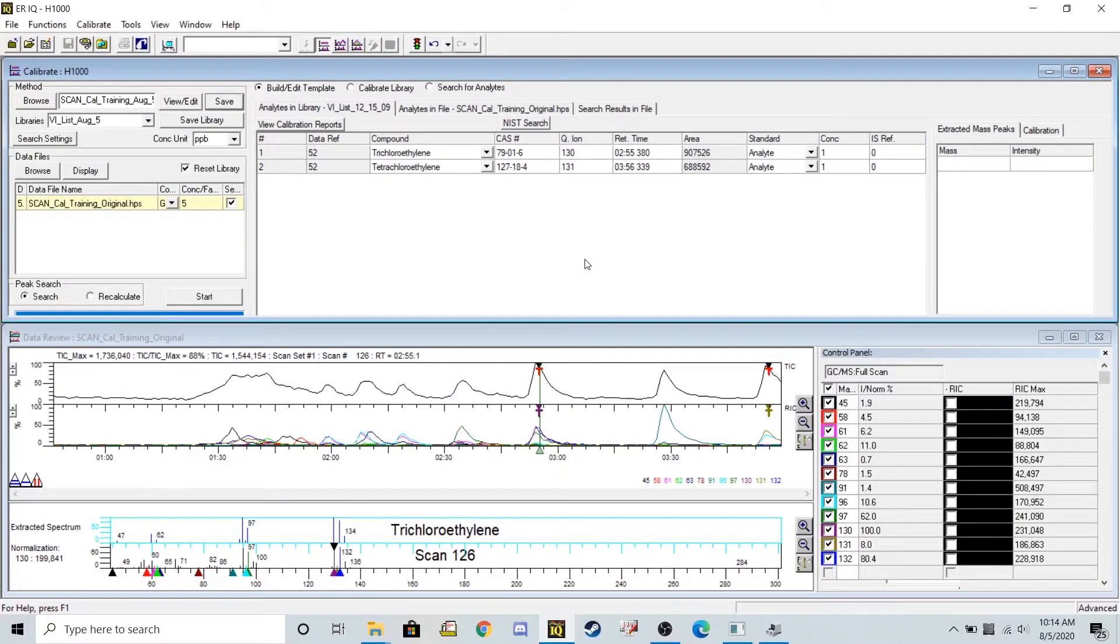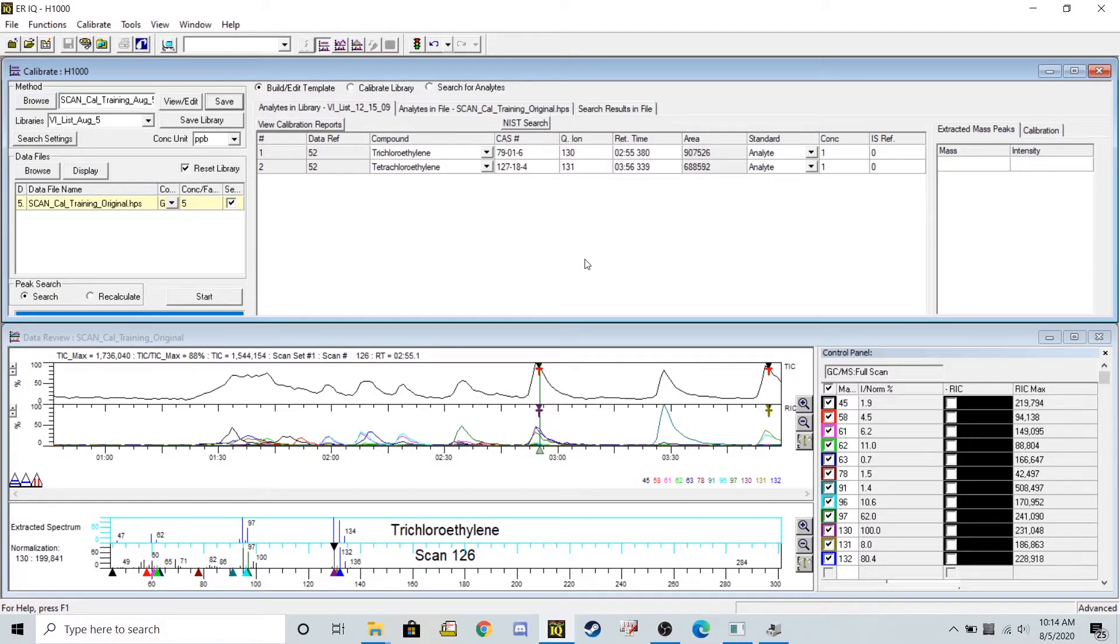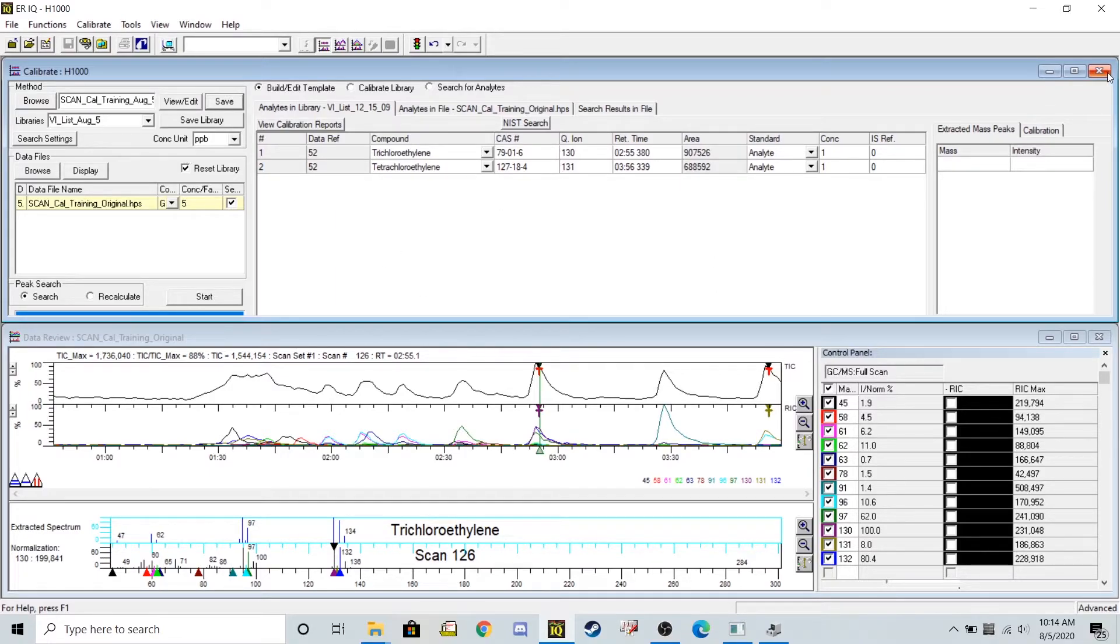Now that I've saved my new library and saved my new method with those criteria, I can go ahead and exit out of this calibration screen.